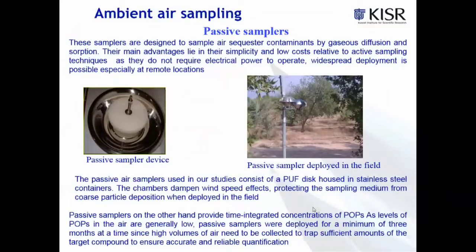So I was saying that the samplers that we used in this regional project, for obvious reasons, were passive samplers, because their main advantage is that they are very simple, they are low cost, and they don't need electrical power to operate. So it's possible to deploy them in remote locations without any problem, and they also have less risk of being vandalized by people.